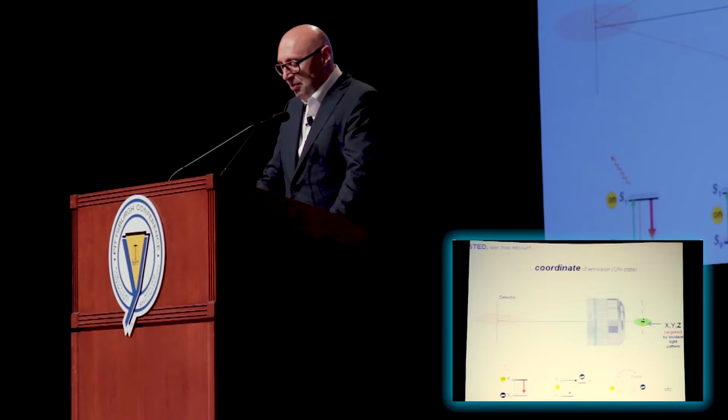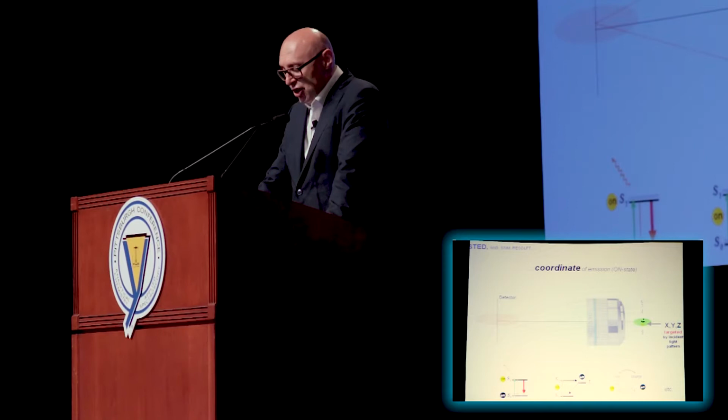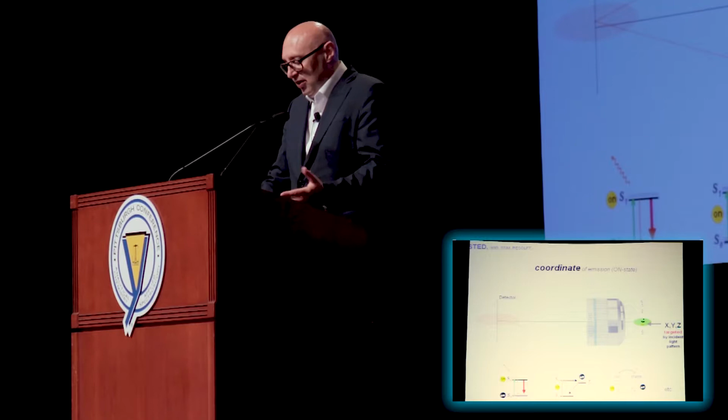You can push molecules to a long-lived dark state, such as a triplet state, or electron transfer, or whatever. You can have a cis-trans isomerization. For example, say the cis form is capable of emitting light. The cis form is a fluorophore, but the trans form is not, so it doesn't emit light if you put excitation light on it, and so on.